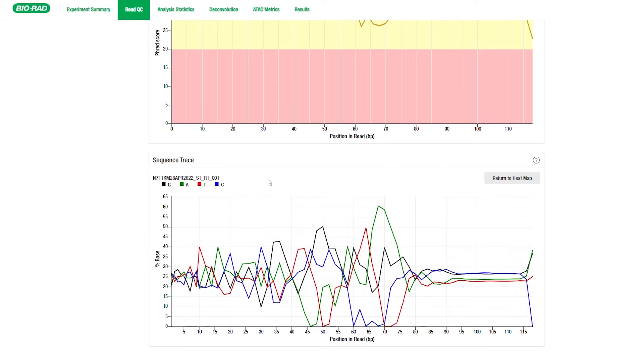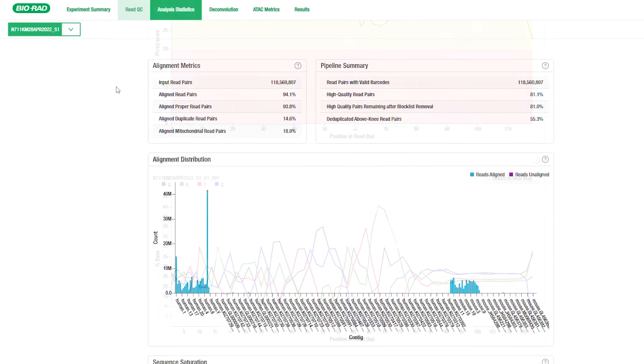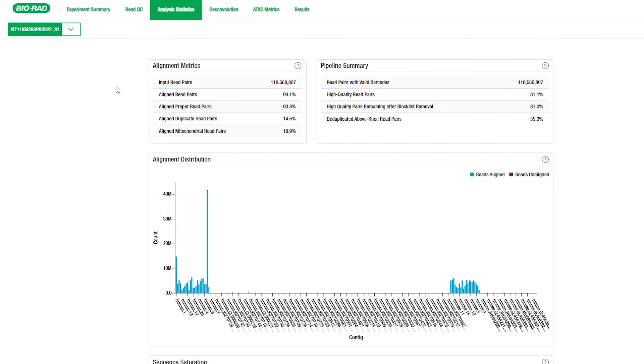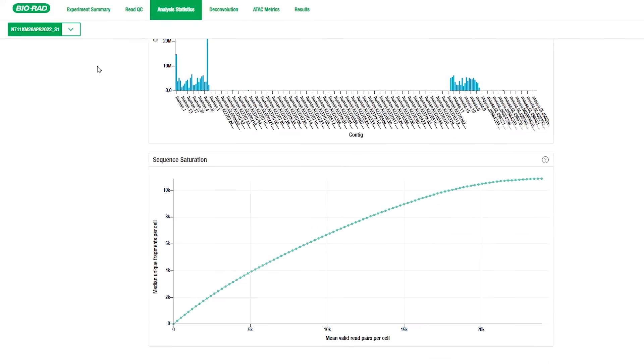The Analysis Statistics tab provides summaries of alignment metrics and READ pair information. Below those tables is the alignment distribution plot illustrating the number of READs that aligned to the different chromosome locations listed in your reference genome. The Sequence Saturation Plot shows the number of unique fragments identified compared to the number of valid READs per cell.